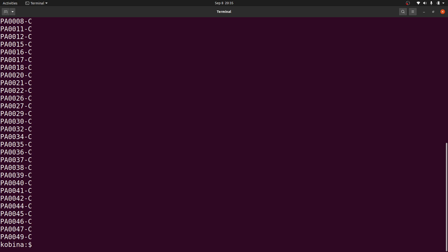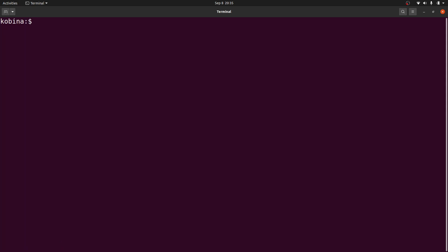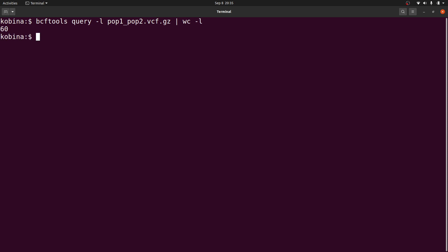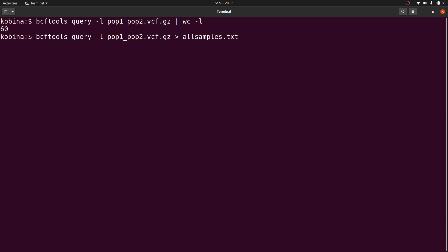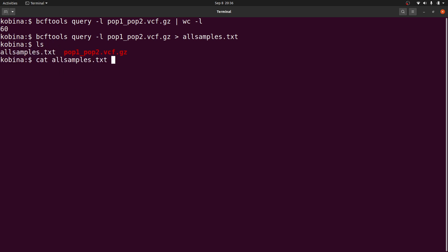The sample names are displayed — call it a sample list, whatever you like. Since this is a multi-sample VCF you can count samples by piping to wc -l; we have 60 samples. You can also save the list to a file by redirecting: bcftools query -l pop1_pop2.vcf.gz > all_samples.txt. Then do a cat or head to see some of the sample names.